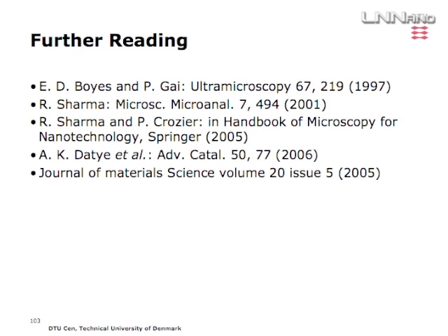And I think I will leave you with this slide, which is a couple of the key references, which shows you a lot about ETEM. This is the Boyes and Gai Ultramicroscopy paper from 97, which shows the design of the differentially pumped column. That's a very nice review by Renu Sharma in Microscopy and Microanalysis from 2001. And then there's an old handbook which has a section devoted to ETEM.